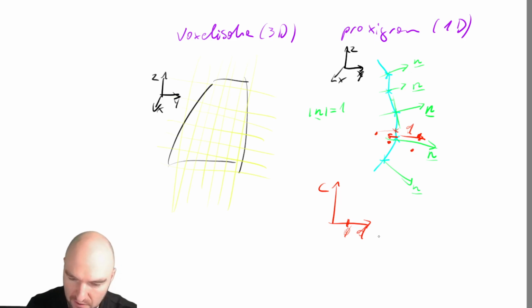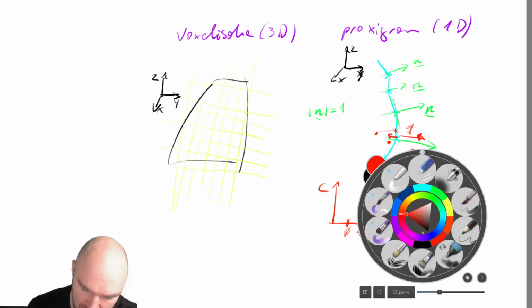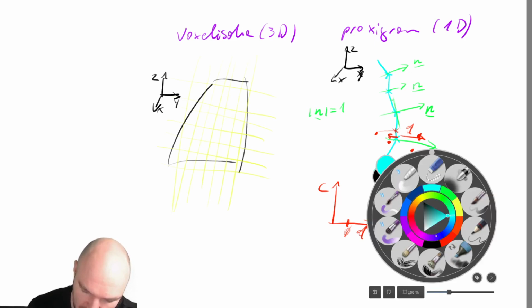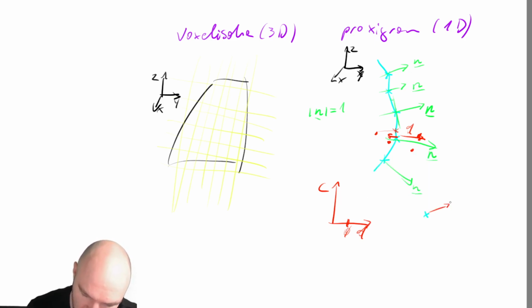Or you could have a proximity histogram to a point object. Then the distance is 0 at the origin of the point. There probably won't be any negative values. You might have a distance d to that point object.